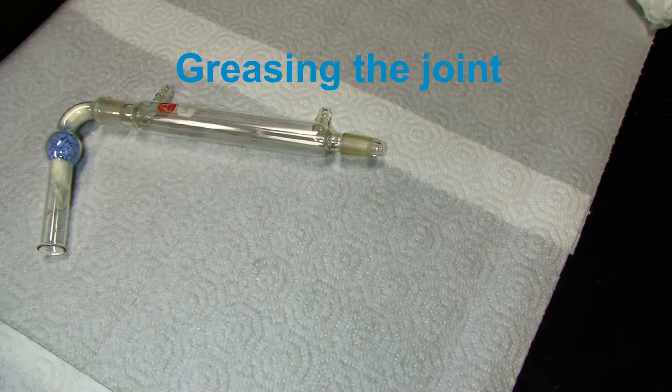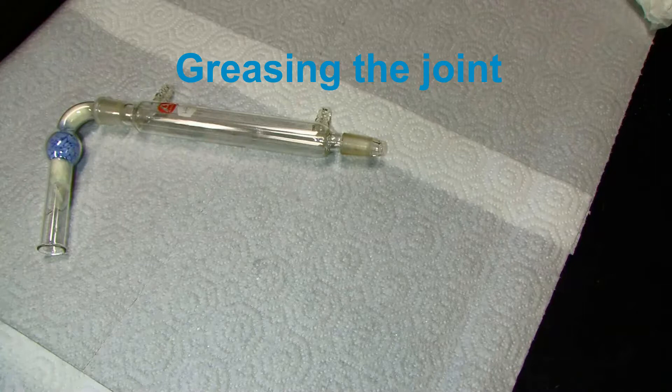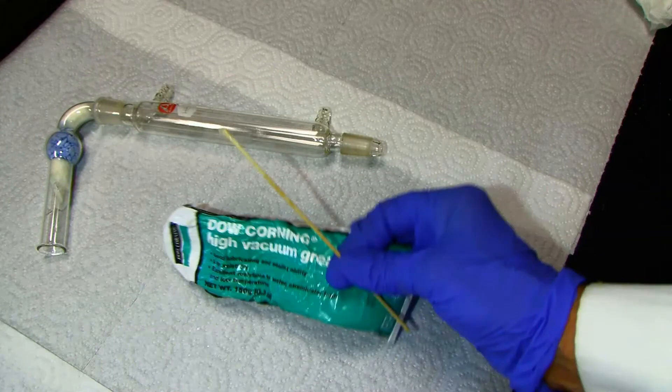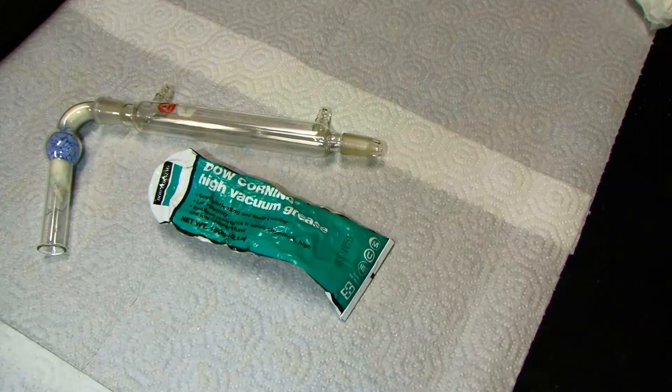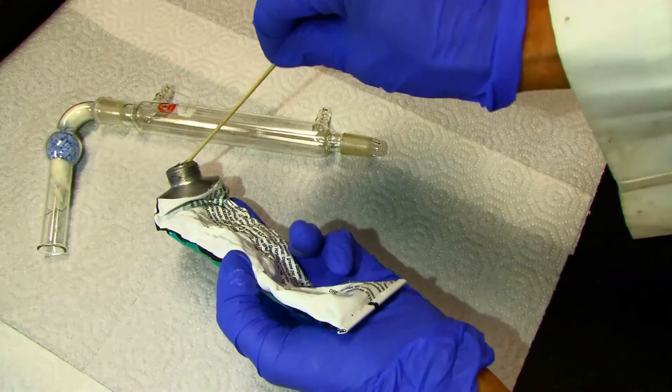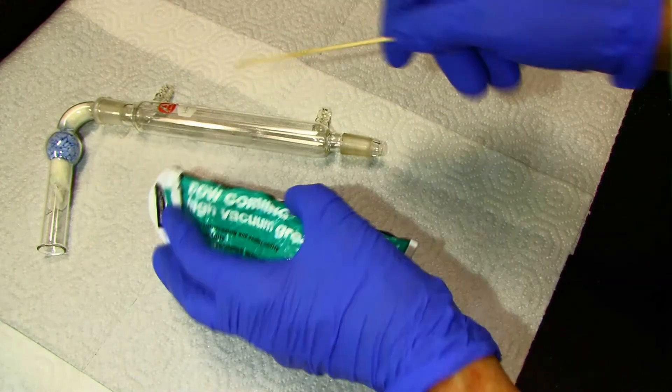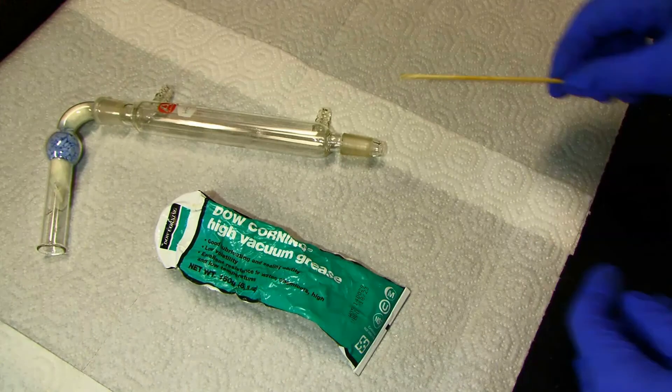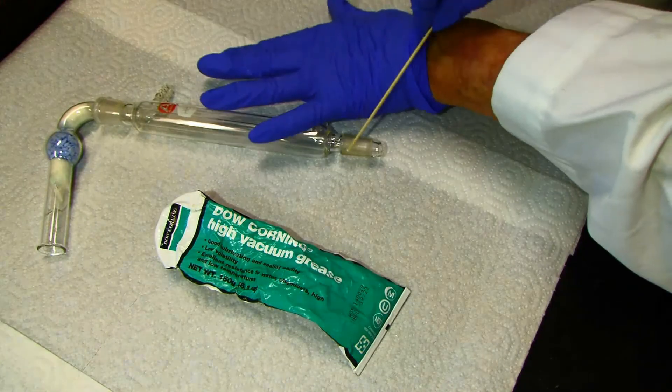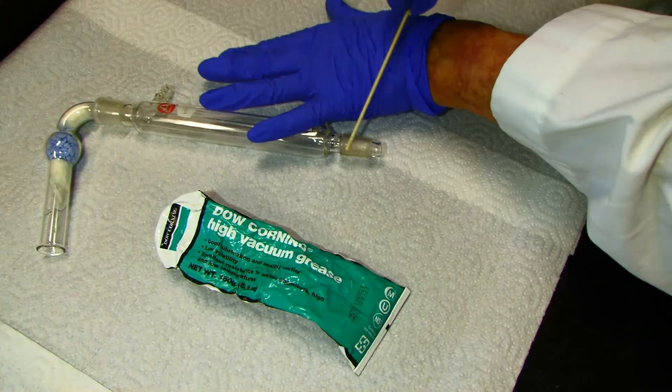After the compounds are added, you need to grease the joint connecting the flask to the condenser. Basically what you're going to do is just take the grease, take a little bit with a stick. You want to do it thin, but pretty much just one stripe down each side.